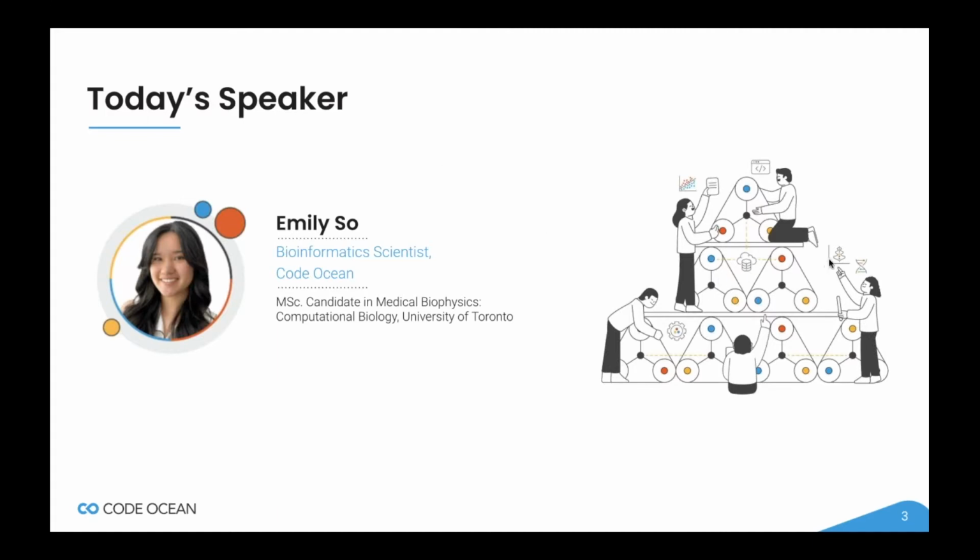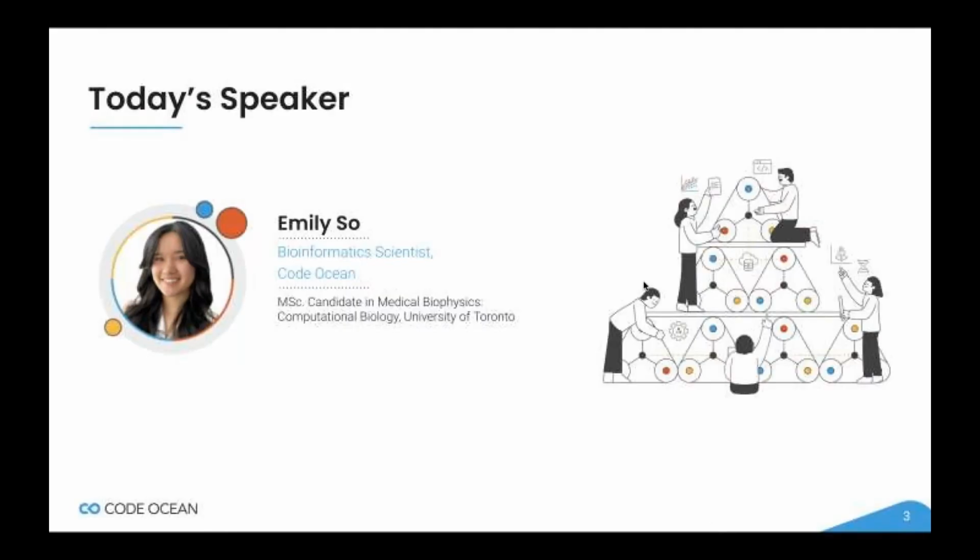Thanks so much, Elena. So like she said, we're going to be talking about interactive visualizations to empower biologists, specifically relating to single-cell RNA-seq.